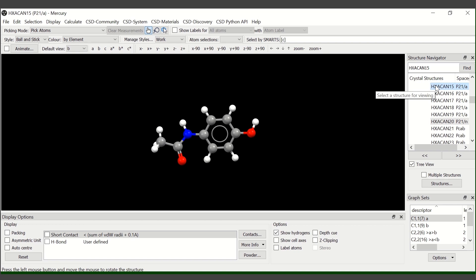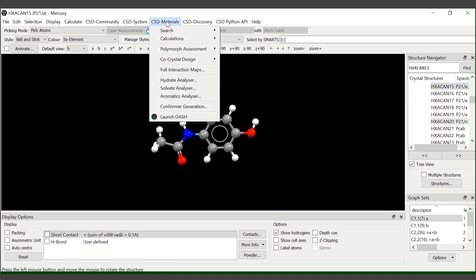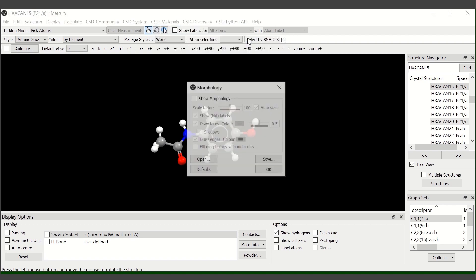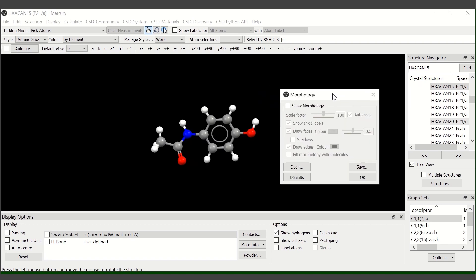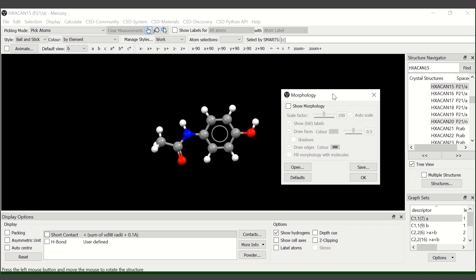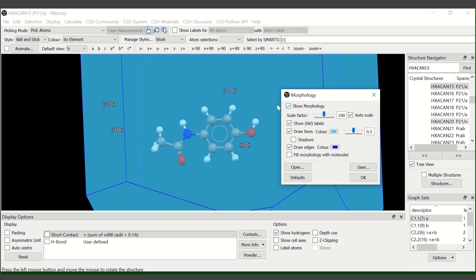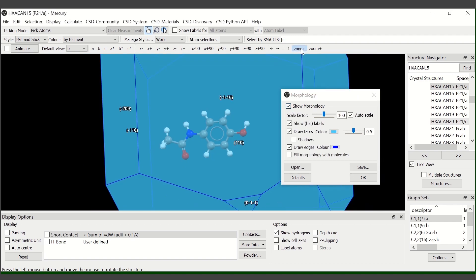To visualize the morphology, we click on the CSD materials menu, calculations, BFDH morphology. From the morphology menu that appears, we tick SHOW morphology to visualize the BFDH morphology.